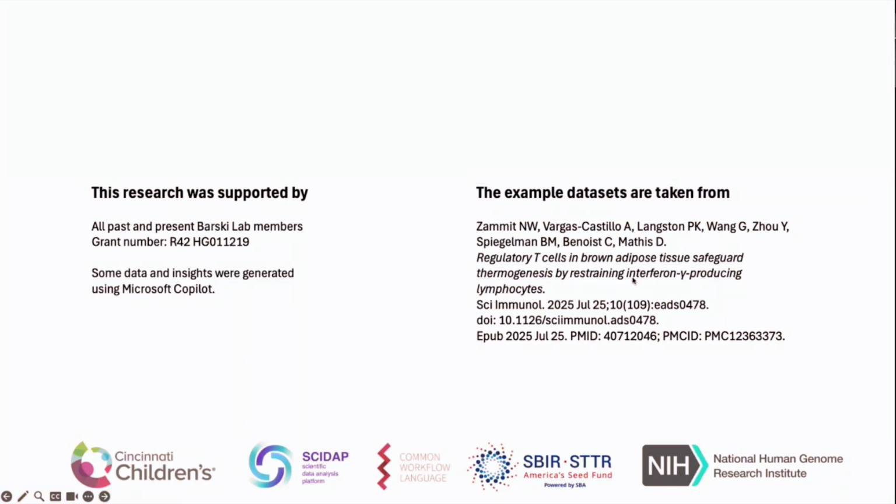Michael, this was a really good presentation, and I think it really highlights how these DESeq2 GLMs are getting to the values that they do. I have an idea and a question for you. The idea: do you have any plans to implement support for results or quantifications coming out of pseudo-aligners, such as Salmon or Kallisto? I'll ask the other question in a second. So the first was, do you have any plans for something like that?